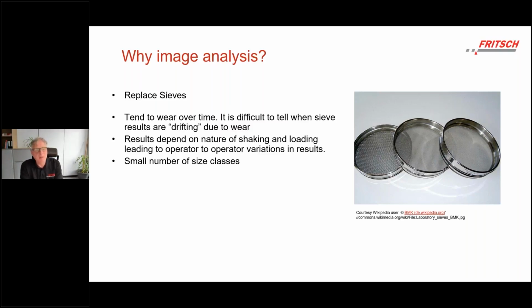And some people, I've seen people, really very roughly using brushes to get the sieves clean again. And as you can imagine, this will shift or displace wires of the sieve and make the openings in between the wires larger, and larger particles can pass through a sieve that is nominally too narrow for this kind of particle. So over time the results will change using always the same sieves.